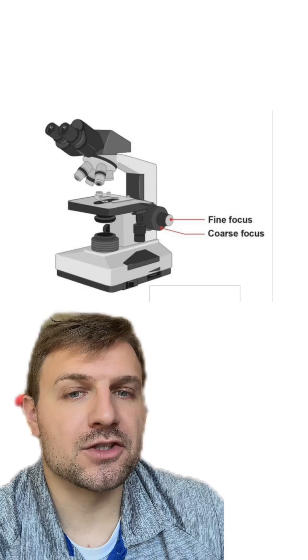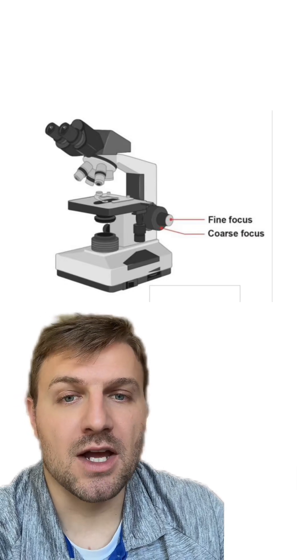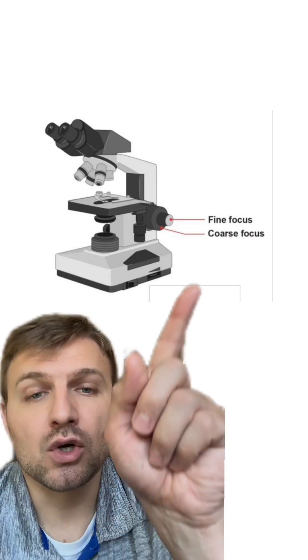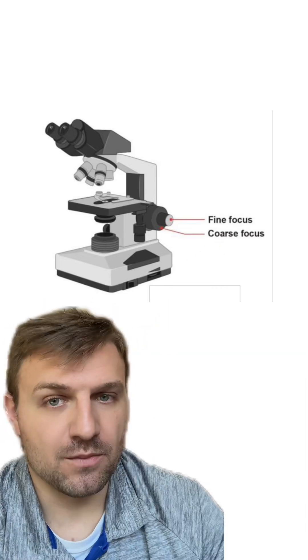Now, something to remember is some microscopes might have the coarse and fine adjustment knobs as one total knob. The coarse adjustment knob, in this case, will just be the larger of the two.